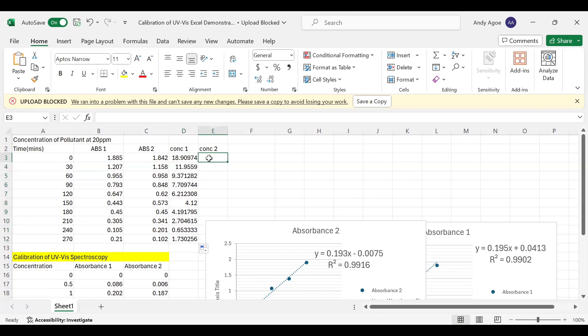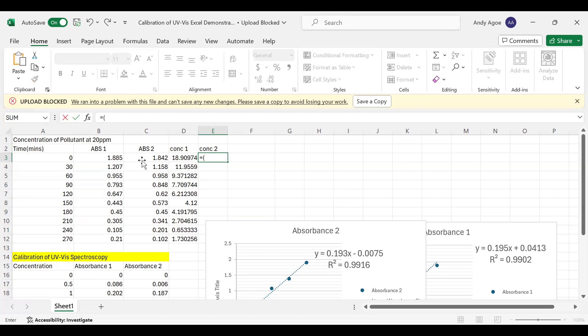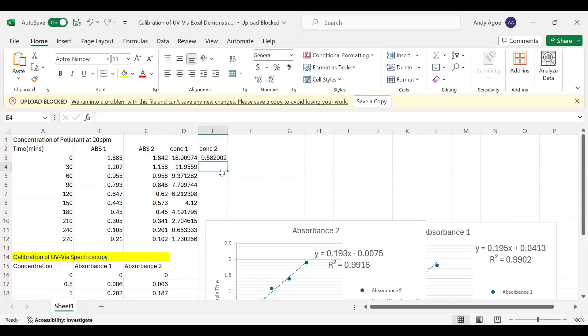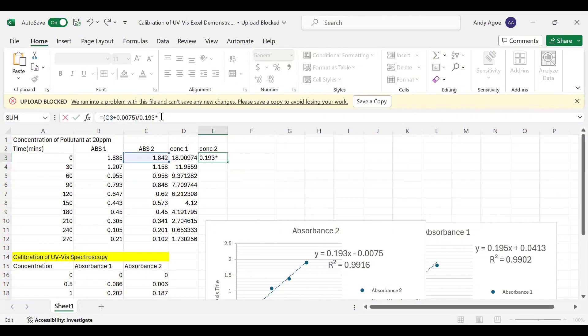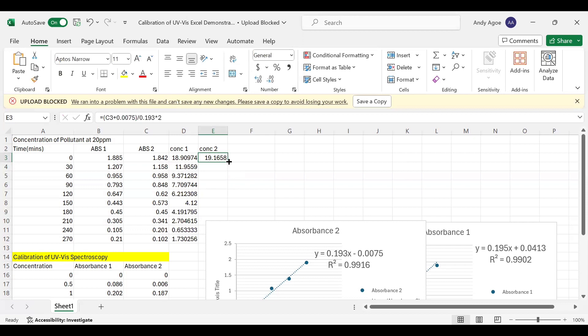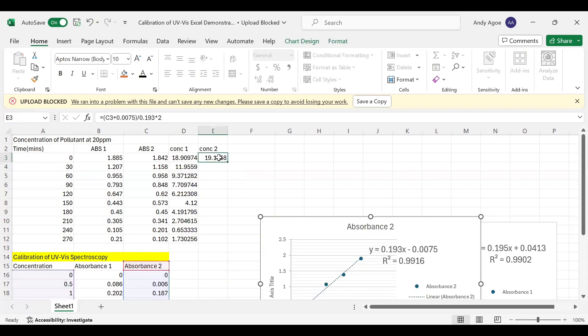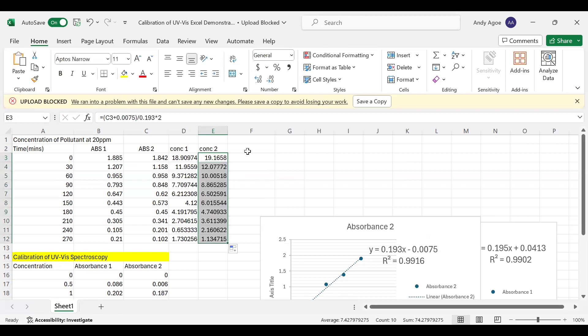Let's do the same for Concentration 2. You bring your open bracket, select Absorbance minus. Our intercept for Absorbance 2 is negative, so once it crosses the equal sign it becomes positive. So we have 0.0075. Then we divide by 0.193, which is the slope. Now we multiply this value by a factor of two. We get our Concentration 2. Then we autofill for this part as well.